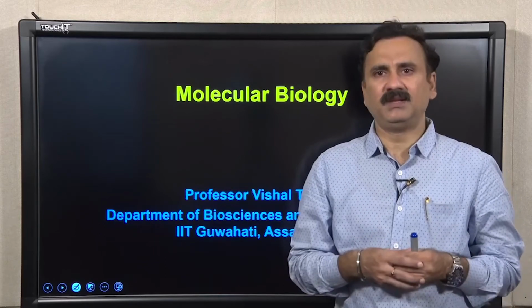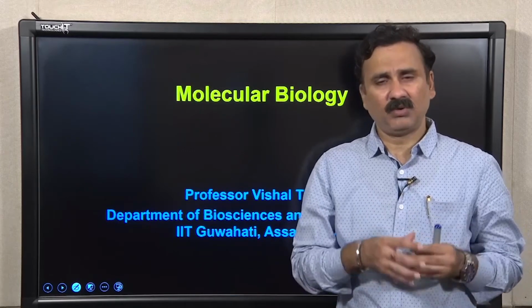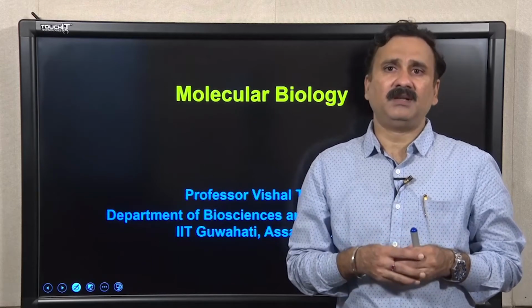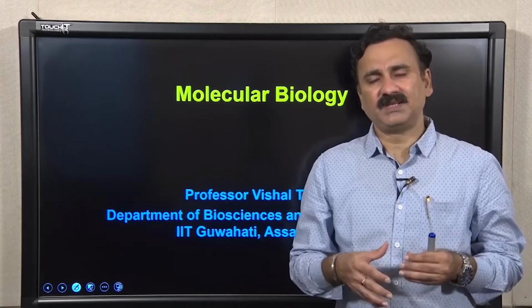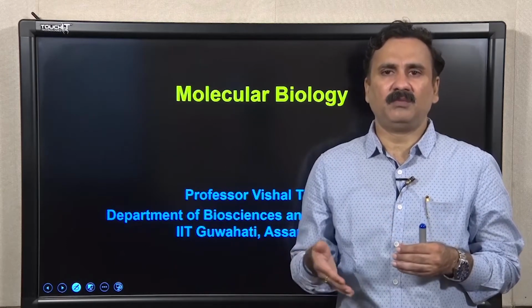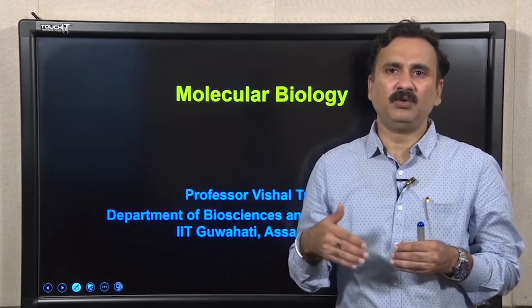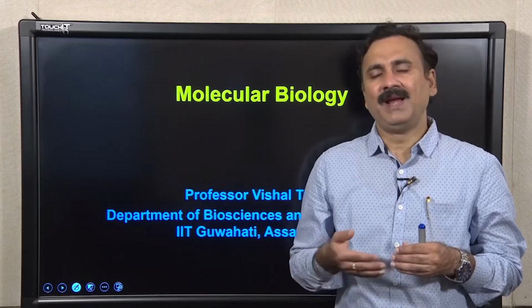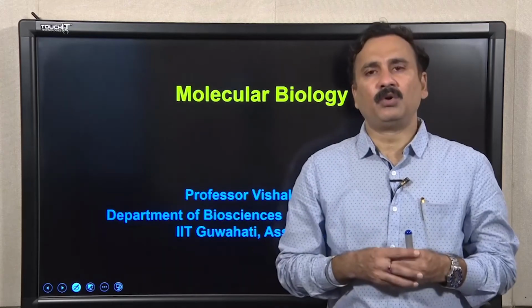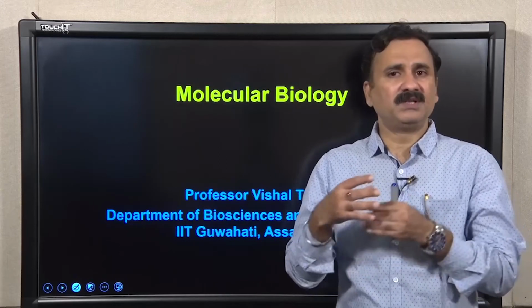And what we were discussing about the different types of blotting techniques. So in this particular series, in our previous lecture, we discussed the northern blotting. The northern blotting is a technique which is used to detect the RNA present in the cell. So what we have discussed is that you first isolate the messenger RNAs from the cell, and then you blot that onto the nitrocellulose membrane, and then you incubate that with the radioactive probe, and then eventually you do the washing, and then ultimately you take the autoradiogram, and that is actually going to give you the signal wherever the gene of your interest is present.